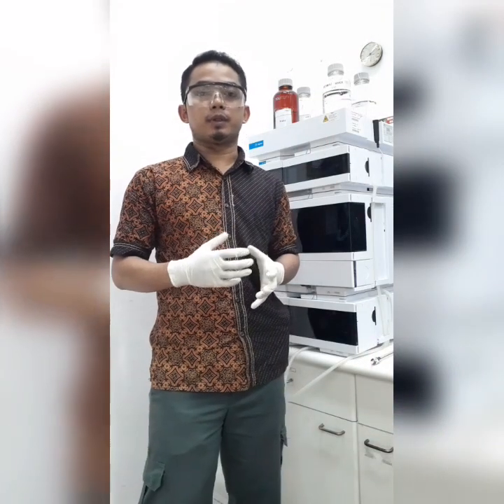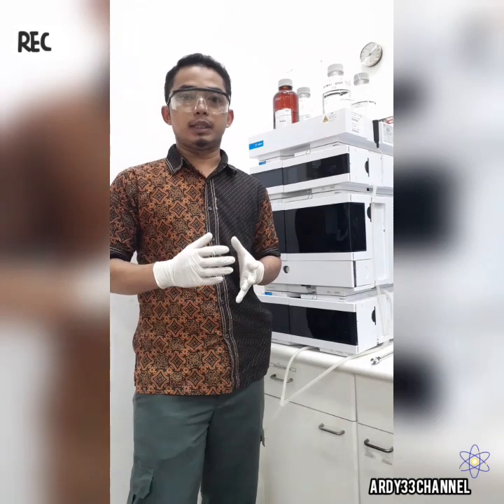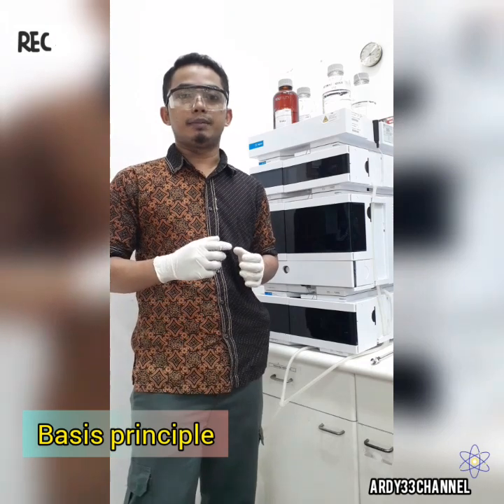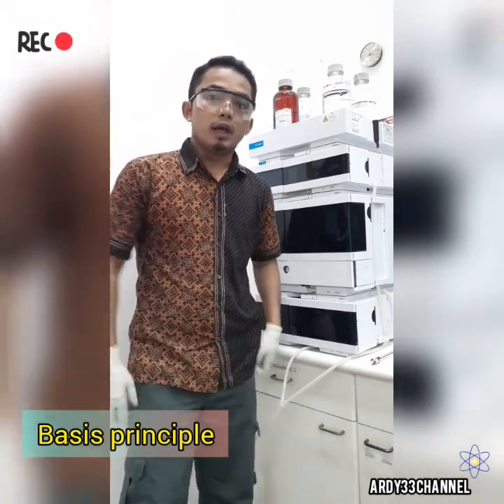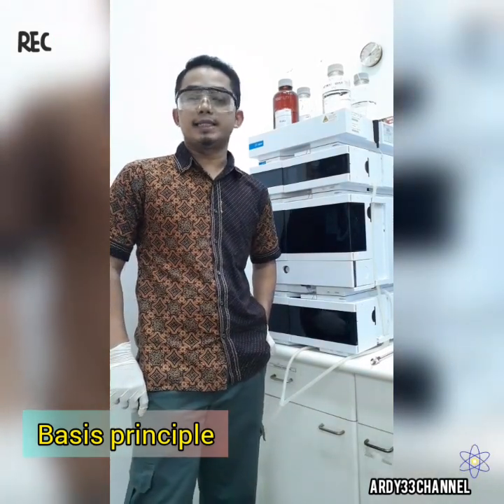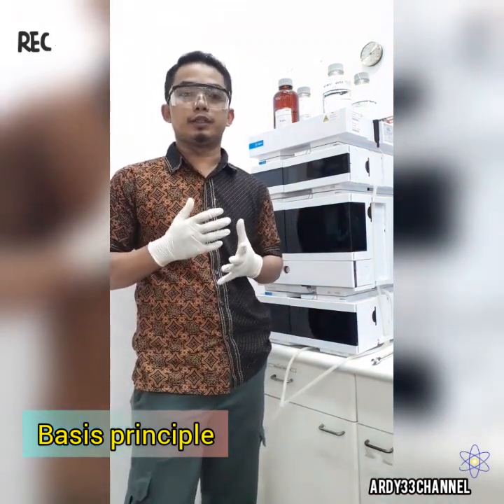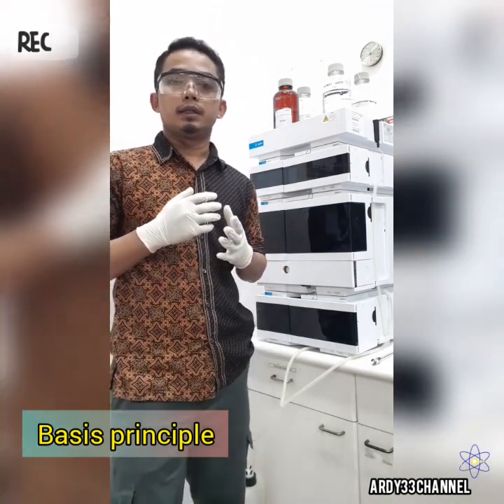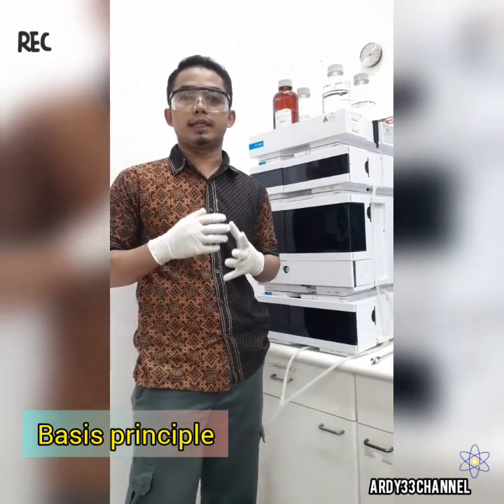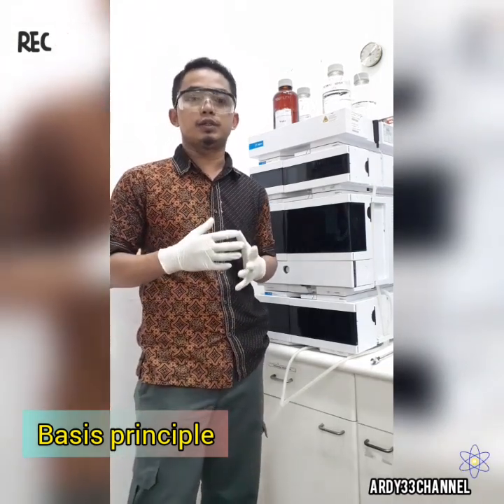The separation principle of HPLC is based on the distribution of the analyte or sample between a mobile phase eluent and the stationary phase or packing material of the column. Depending on the chemical structure of the analyte, the molecules are retained while passing the stationary phase. The specific intermolecular interaction between the molecules of the sample and the packing material defines their time on the column. Hence, different constituents of the sample are eluted at different times. Thereby, the separation of the sample ingredients is achieved.